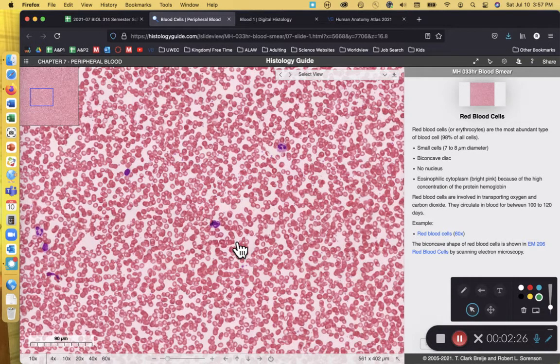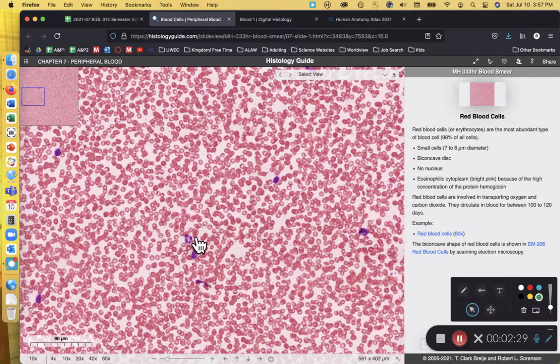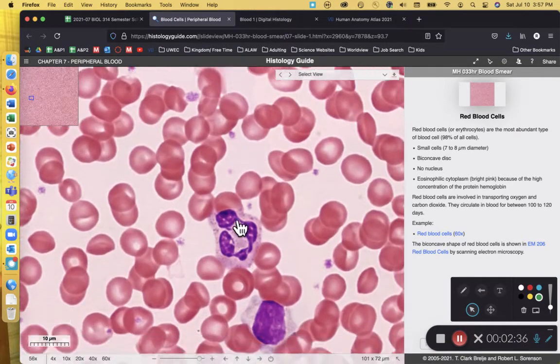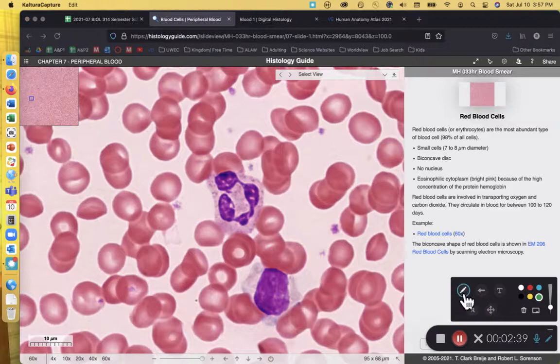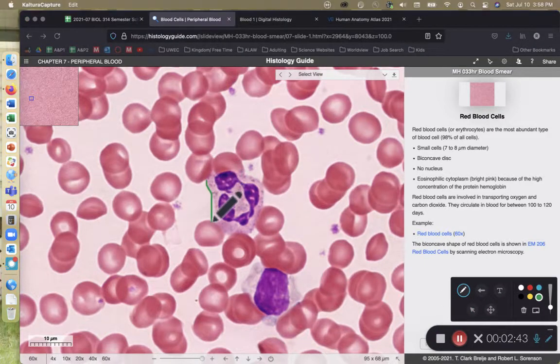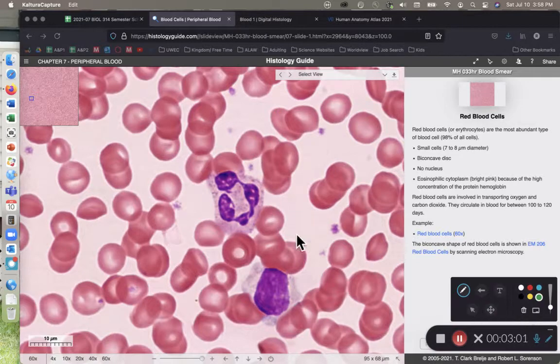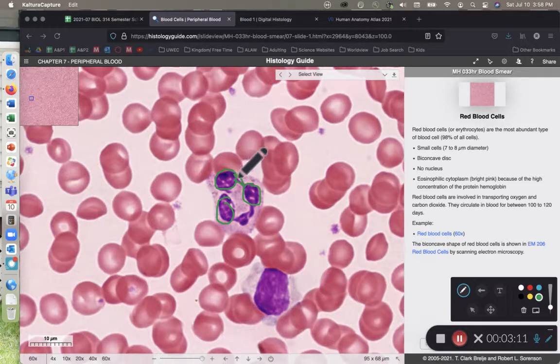As we look at these leukocytes, we're going to use our erythrocytes as a frame of reference. I'm going to start with the single most common kind of leukocyte, and that is a neutrophil. Here's a textbook-perfect neutrophil. As we look at this neutrophil, it's going to be wider in diameter — about double the diameter of your typical erythrocyte. As we look at the nuclei within this neutrophil, we have a single nucleus that's multi-lobed. Here we see three lobes, with little isthmuses connecting the lobes of the neutrophil nucleus.